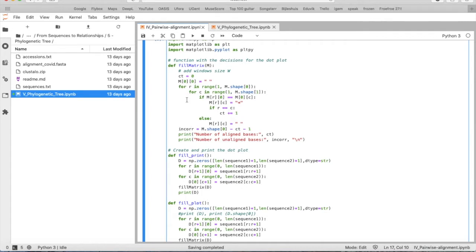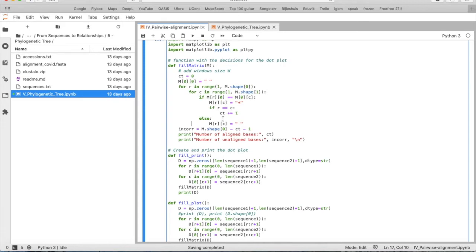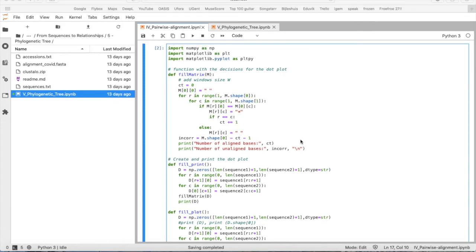And when they are the same, when they match, we place a dot like this. And we say okay, they match, so we add one to our count. If they don't match, we put nothing. And now we want to plot these dot plots.